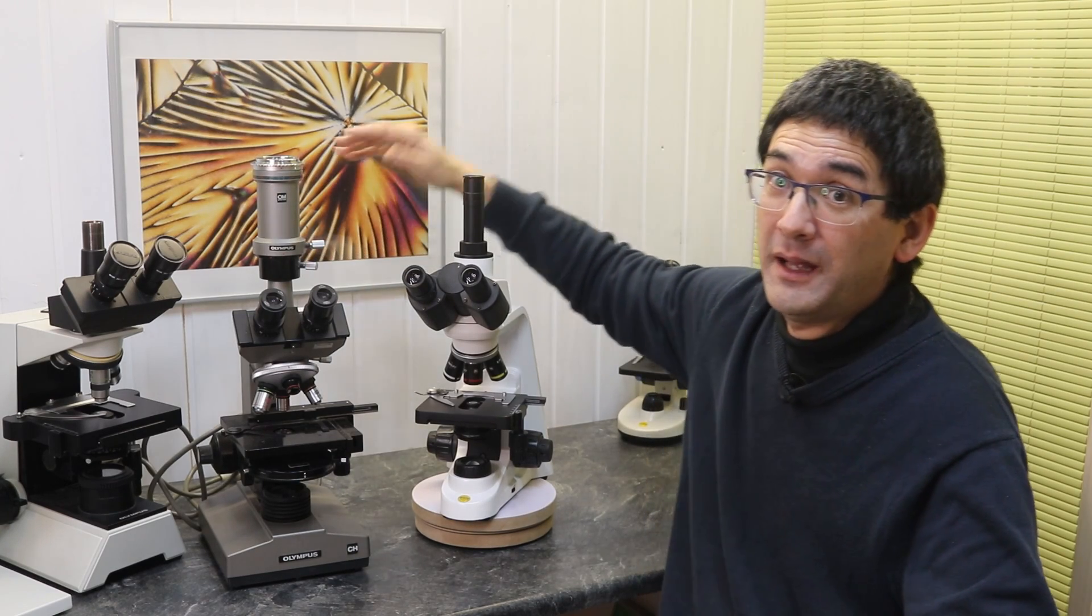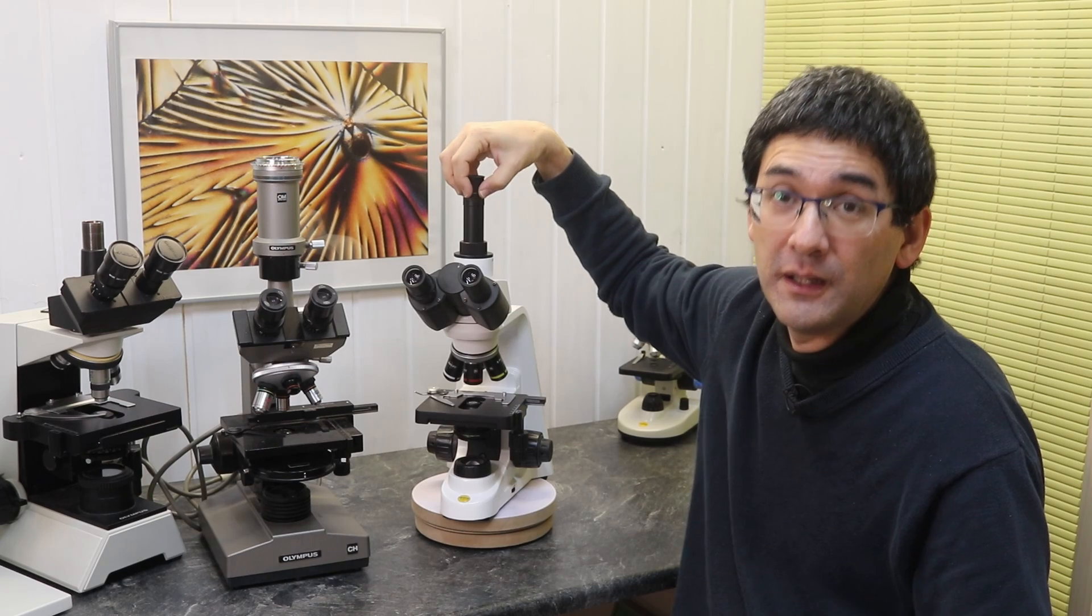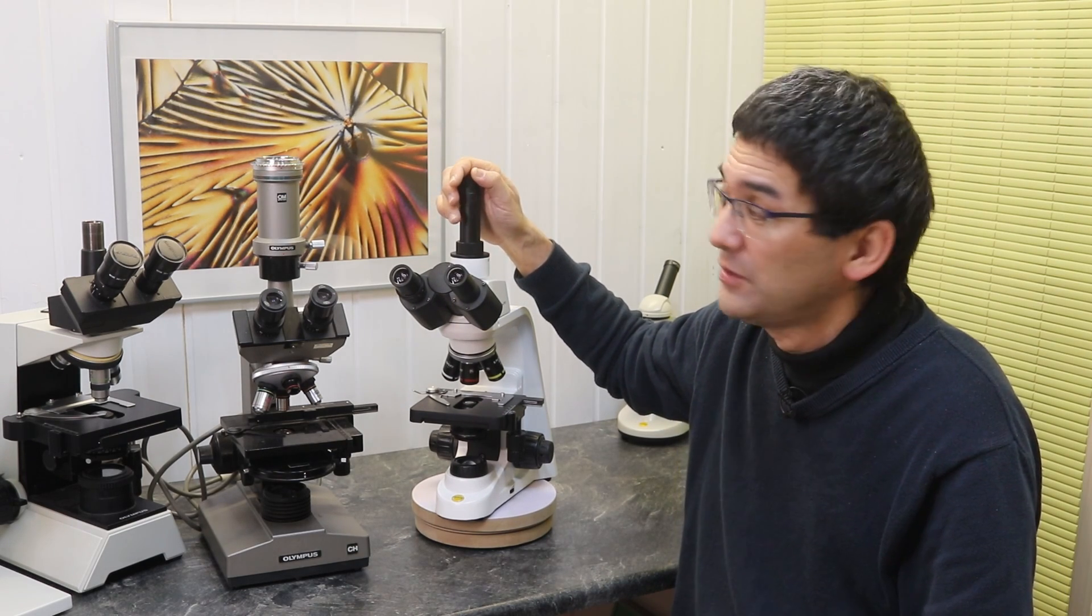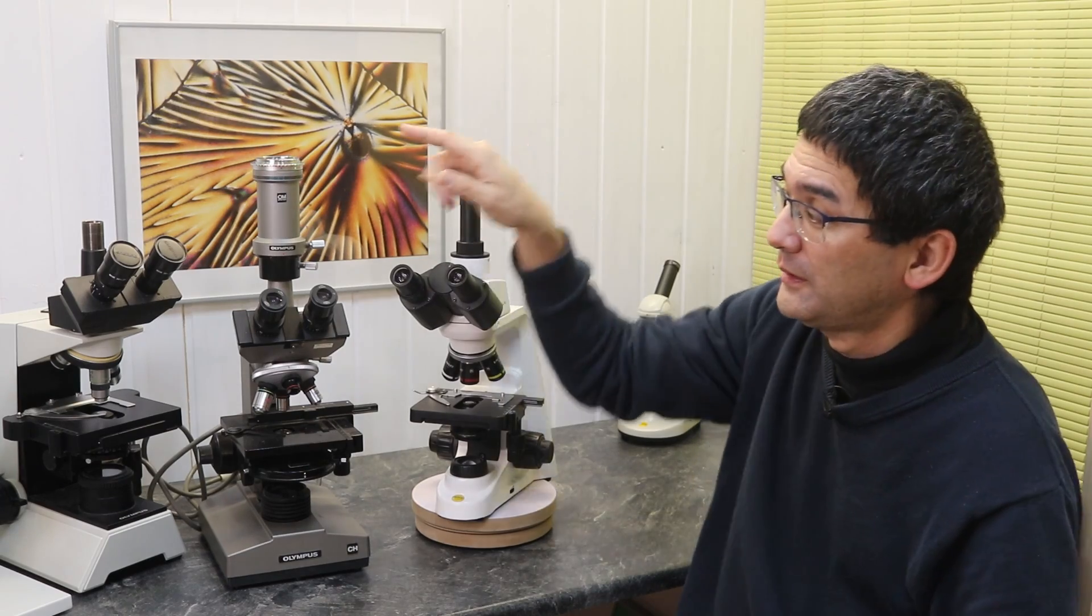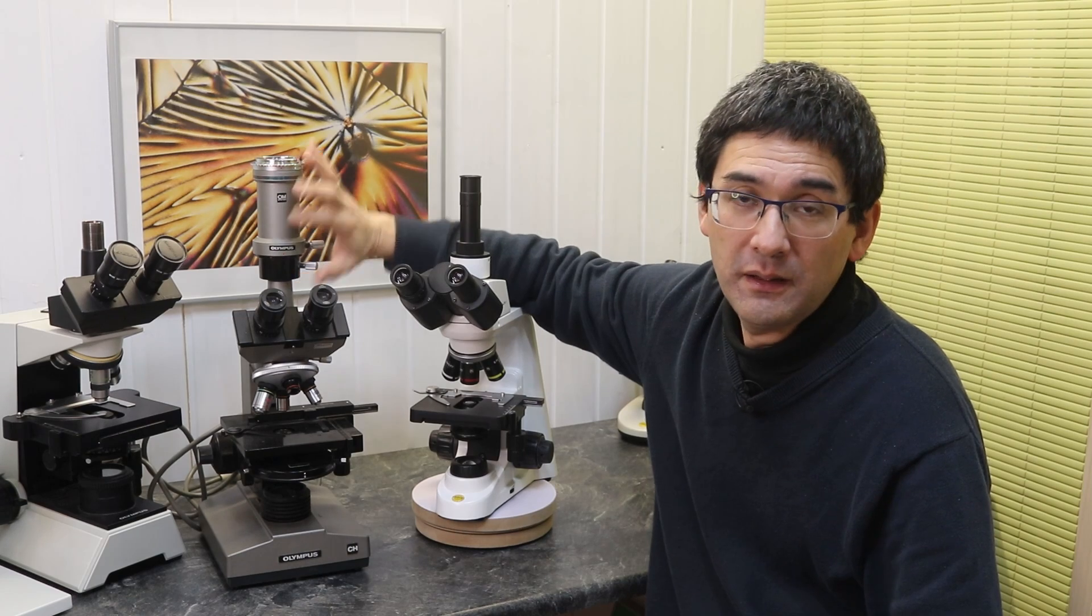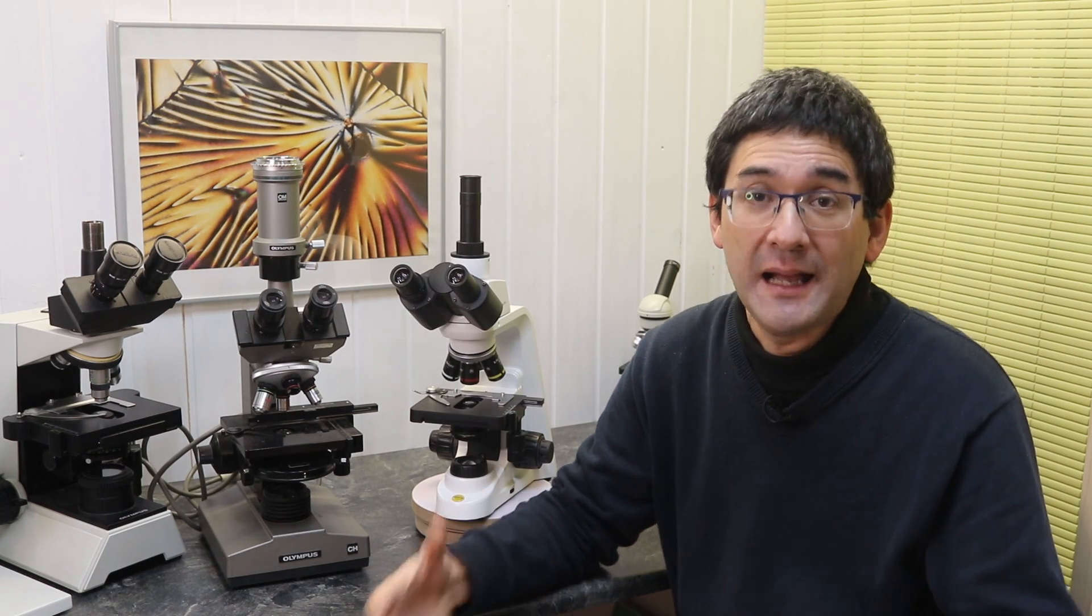It's not cheap, the whole system. However I have had problems getting a decent adapter for the modern microscopes because they're all designed to connect a microscope camera up here, not a DSLR. There are some DSLR adapters around but they were not really satisfactory. Some time ago they had a complete system available like the one over here and it worked great. That's why I would say it's almost ideal if you want to connect a DSLR camera. With the modern microscopes I had some problems connecting cameras because the image quality simply isn't as good.